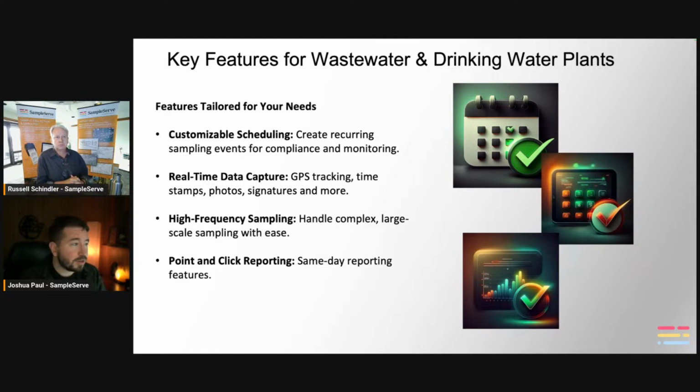events. Before, you just created a sampling event. Groundwater people, they'd go out maybe quarterly for monitoring. So this wasn't necessarily needed for them, but it is still nice for them as well. Recurring sampling events are really easy to schedule. You can make sure you have all your sampling events scheduled on the field app for your field technician to go out, and he or she will know exactly when those will happen. Yeah, and then open up that day's events and everything's right there.